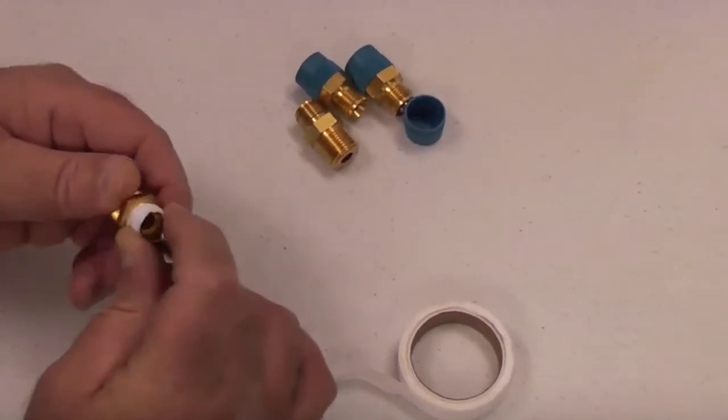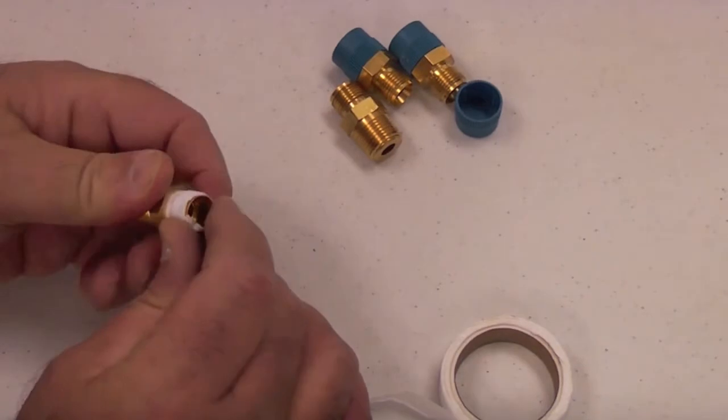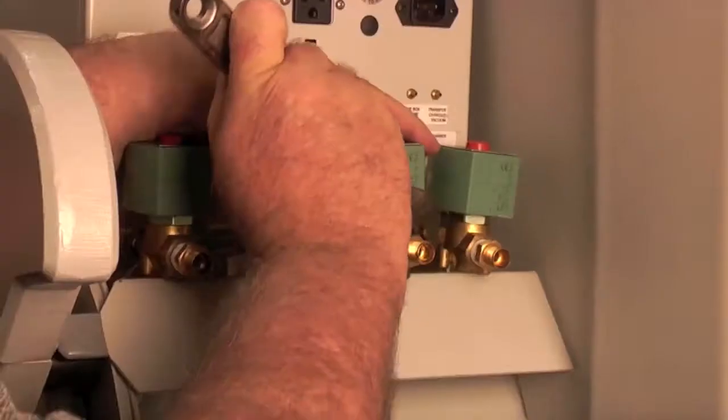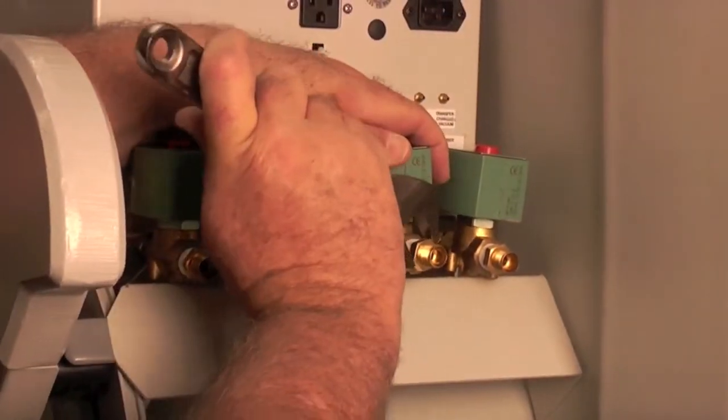First, wrap the male 3/8 inch NPT threads on each of the four fittings with Teflon tape. Then, screw them into the four glovebox solenoid valves. Use an adjustable crescent wrench for tightening.